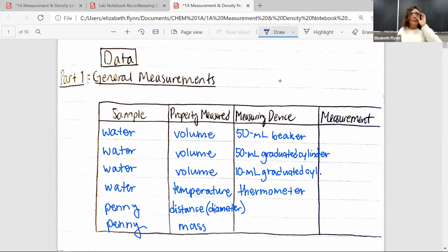So remember, you can find one either in your home if you have one, you can print one out, or you can use one on your phone. Just make sure that it's accurate, that it measures your screen resolution and your screen size. But as long as it's a metric ruler, you can use it. And the mass, so we're going to use a digital scale. All right, so let's begin taking some measurements. I'm going to stop share and move my camera over to the side real quick.